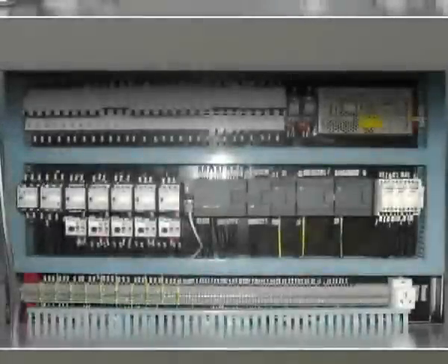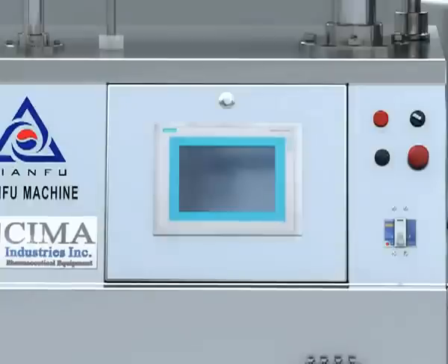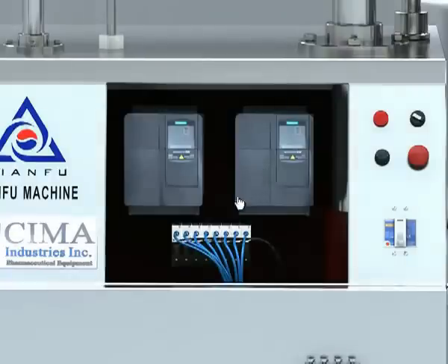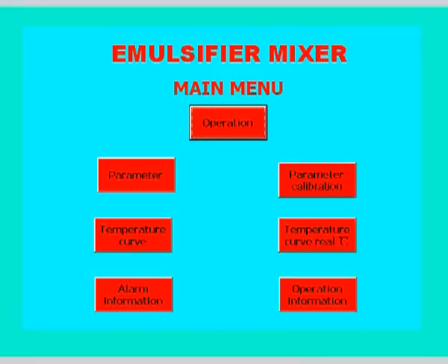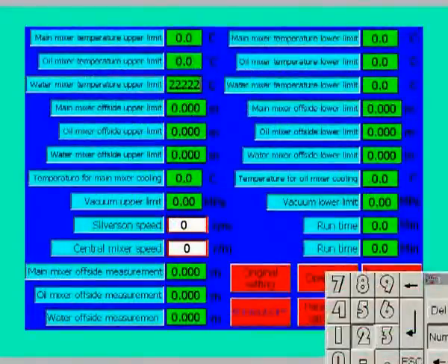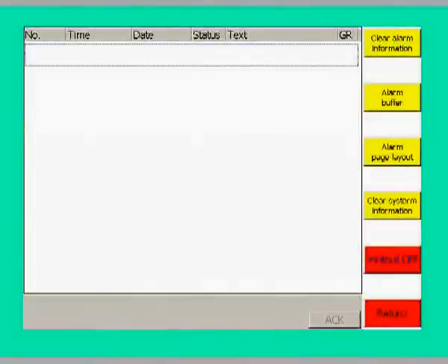7. Electric control system. It is made up of PLC, circuit breaker, heat protector, touch screen, frequency converter, temperature transducer, and electromagnetic valve. The touch screen will display the control screen, parameter set screen, parameter updating screen, temperature curve screen, warning screen, and password protection.